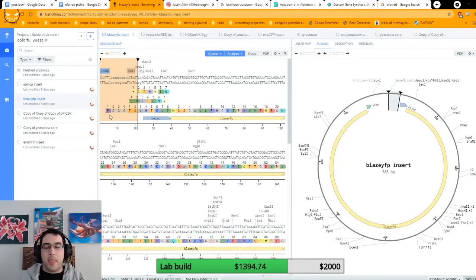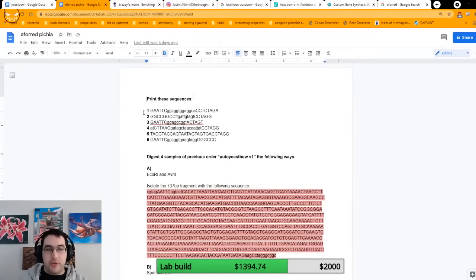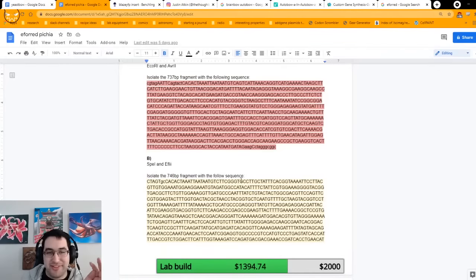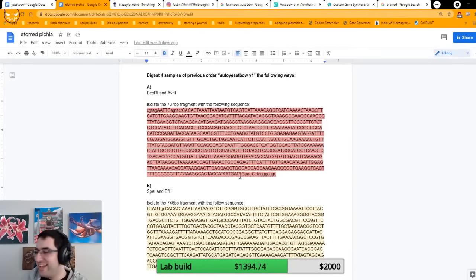Hopefully that makes sense. Because the red one just fits in directly, I only need to make 6 adapters. If we look at the synth file, here are the 6 adapters. Of course, I'm a turnip, so I didn't label these when I put them in. I know they're paired up, but I don't know which is which, so I'm going to have to check that.